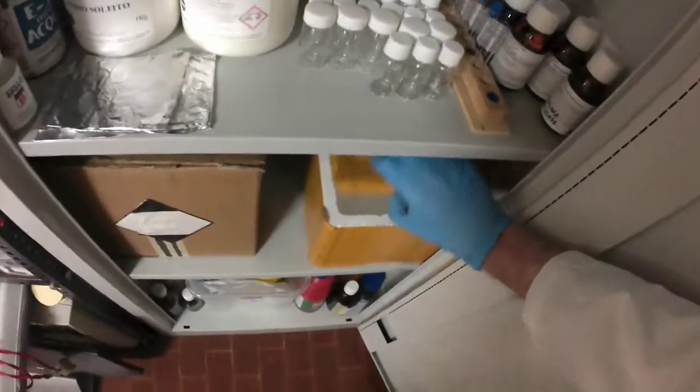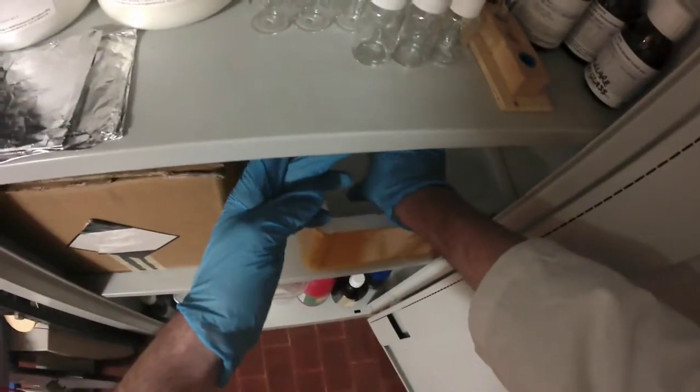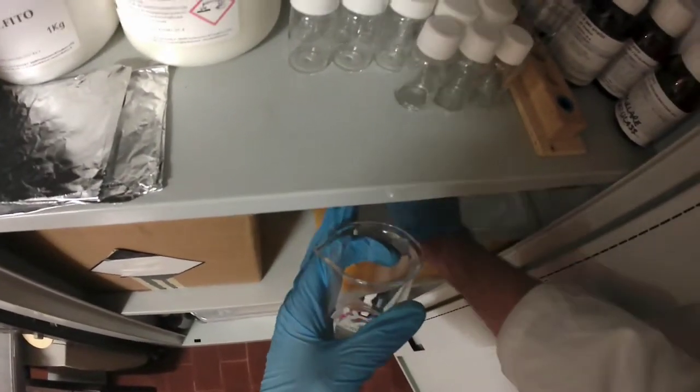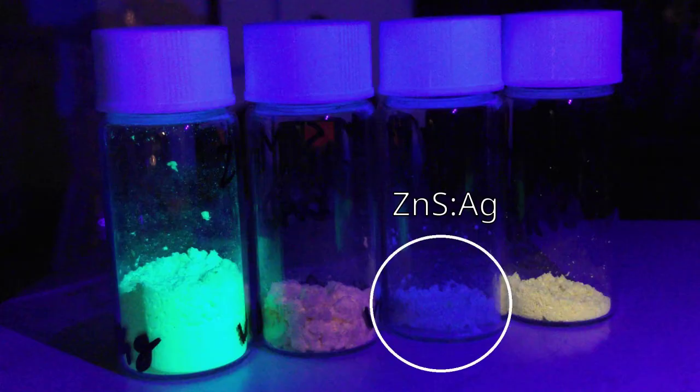Welcome back to the lab. Today we continue purifying reagents to eventually make some phosphorescent materials. If you look at my first attempt at making a silver doped blue phosphor, it was very dim. The main problem was the purity of my silver nitrate, and this is what we are going to fix today.